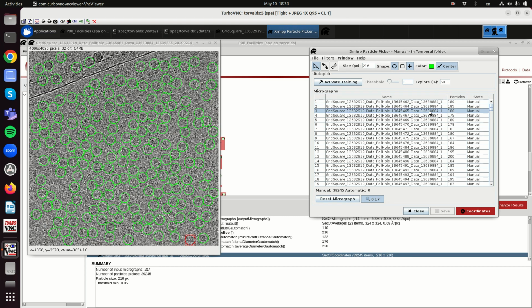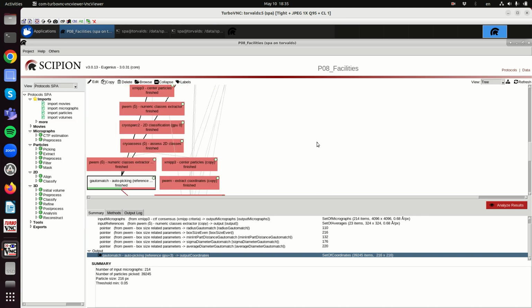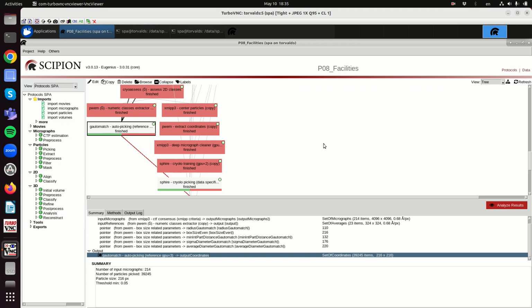Yeah, here there are some mistakes. So we have doubled the number of particles on half of the micrographs. So half of the micrographs had problems with ice and different beam tilt problems. And by using a more sophisticated image processing, we are able to double the number of particles on half of the micrographs. So if everything was perfect, you can imagine that you can have 4 times more particles. 4 times because you are not halving the number of micrographs, and because you are doubling the number of particles.